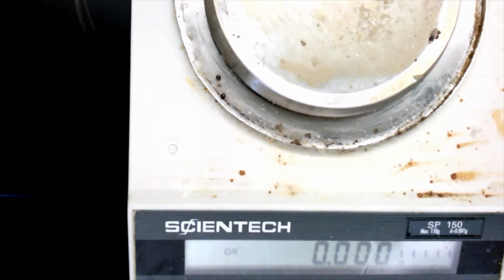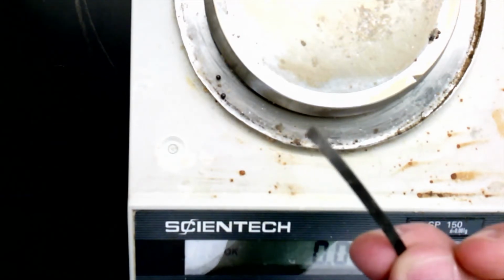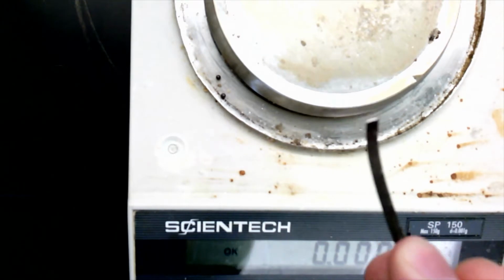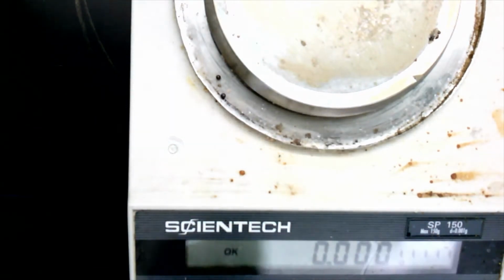So we're going to be reacting magnesium, a little piece of magnesium ribbon. So here's my piece of magnesium ribbon. Okay, you might be able to tell it's pretty dark. It doesn't look real shiny and lustrous like we would normally expect a metal to. So the first thing I need to do is take a piece of sandpaper and just polish this real well.